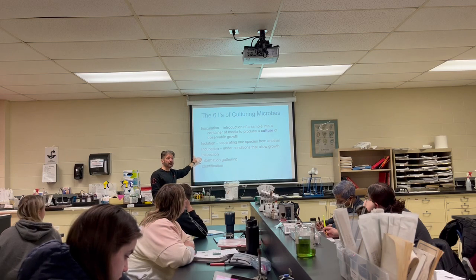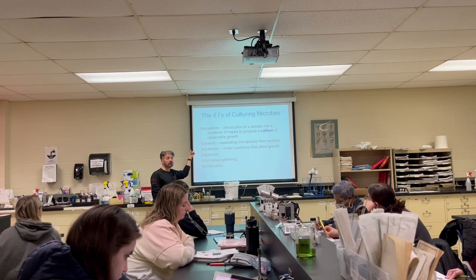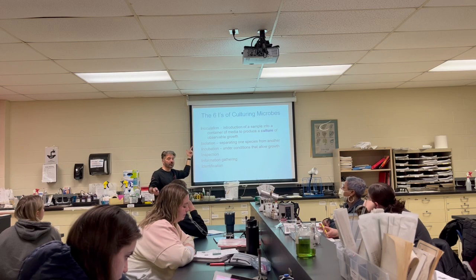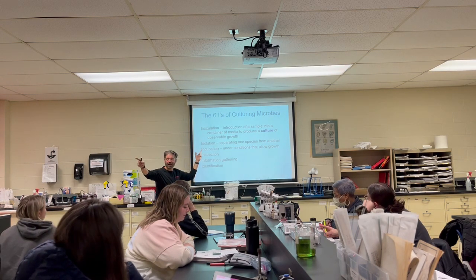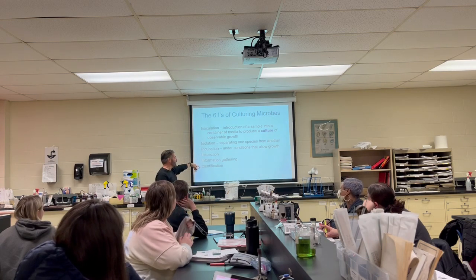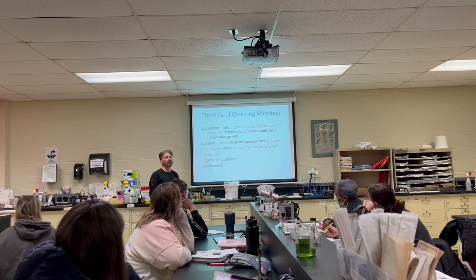We're going to inspect it. So how can I inspect bacteria? What are some things I can do? It's stain, right? And what did you say? Put it underneath the microscope. Microscope. Thank you, yes. All right, and then I got information, identify it, and then I can determine what might be my plan.